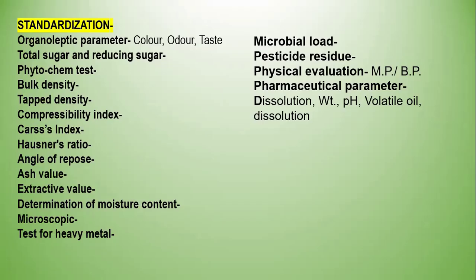Then physico-chemical evaluation such as melting point and boiling point. If the preparations are solids, we check the melting point; if liquids, we check the boiling point. Then the pharmaceutical parameters such as dissolution, weight, pH, and volatile oil content. There are several such parameters.